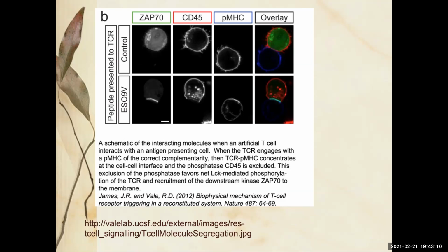You might have to, depending how it goes, by the time it gets to your screen, you might not see it, but there's a second cell here that's round, and it's just very dim because real biology is like that, especially when you're doing real experiments with cool stuff. Sometimes you can barely see your signal. In fluorescence, it's almost always about, can I see my signal? It's only plants where you're like, whoa, too much signal. But other than that, you're always trying to see something very dim and very ephemeral. That just means it comes and it goes.